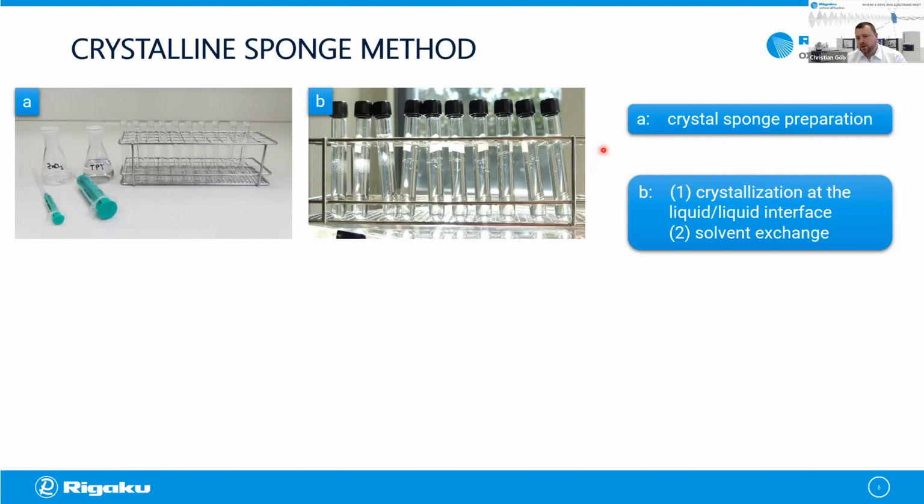So for every setup that you have, the type of X-ray source, the optics that you have, you want to have either larger or smaller crystals. Be aware, smaller crystals soak analyte molecules better than large crystals due to diffusion effects. After you synthesize the crystals in the range that you would like to have, you could at any point stop the crystallization process, of course. You shake down the crystals, collect them in a single vial, and then do a slow solvent exchange. So gradually you need to replace the crystallization liquid with inert hexane or cyclohexane.